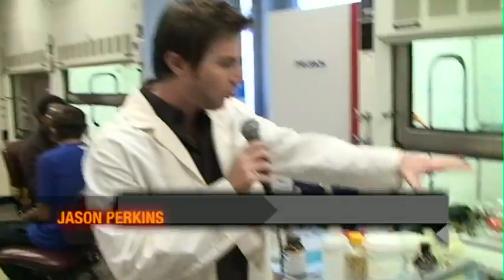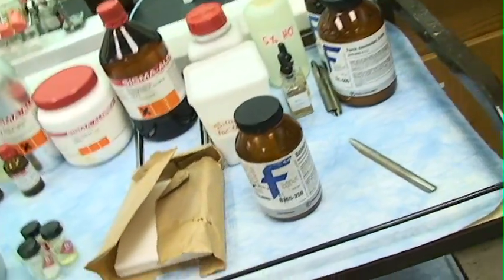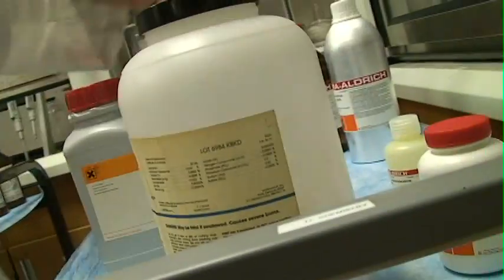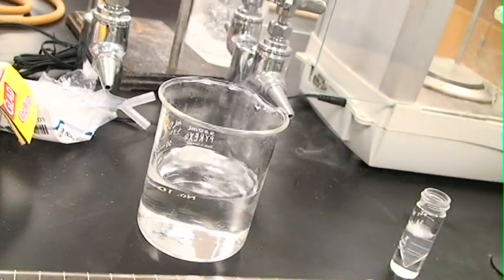Jason is back on campus for a quick look at Columbus State's chemistry lab. They have all the ingredients to make it fun and challenging at the same time. That's your potassium hydroxide. You put it in water.